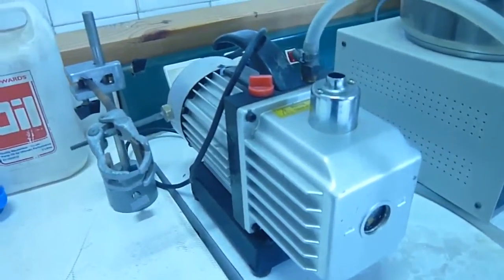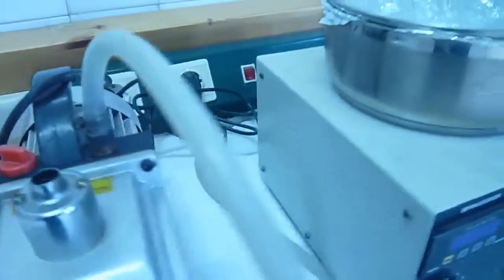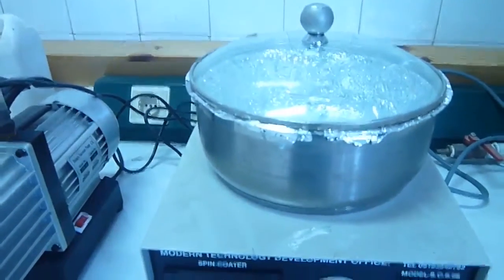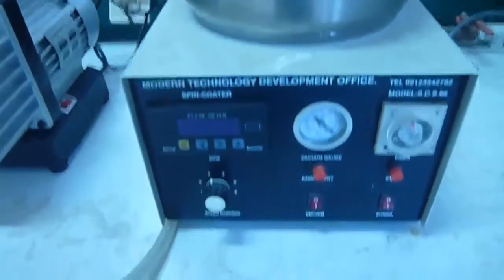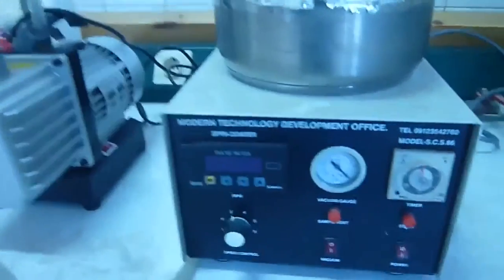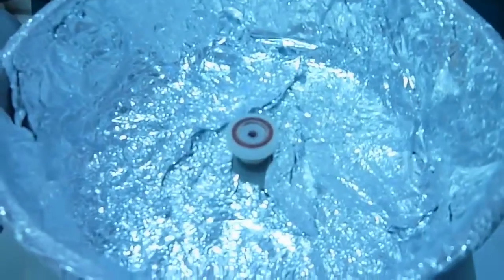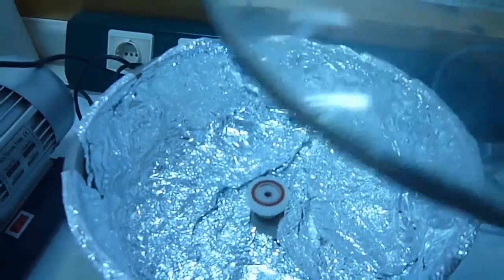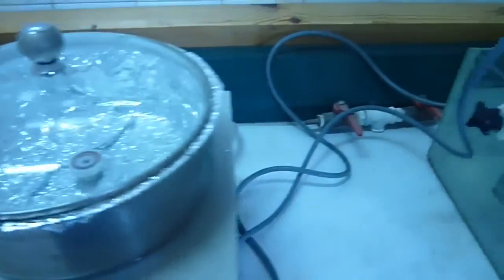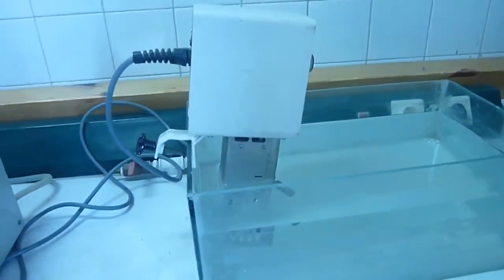Today, I would eagerly like to describe and demonstrate some equipment and techniques in our laboratories, which we use to promote our solid-state physics knowledge as experimental. Here, all the projects are supervised by Professor Dr. Hanlari. We try to apply cutting-edge techniques for obtaining significant results in this field, especially growth and deposition of thin films and also fabrication of semiconductor nanostructures due to their vast applications, and also investigation of these systems' properties by different methods of spectroscopy.